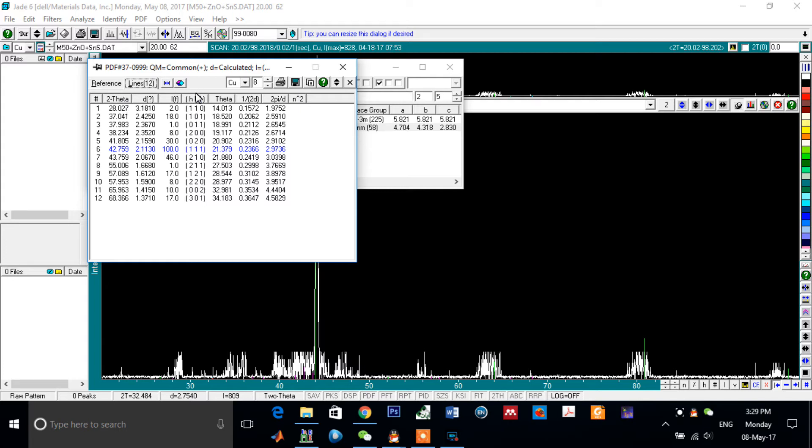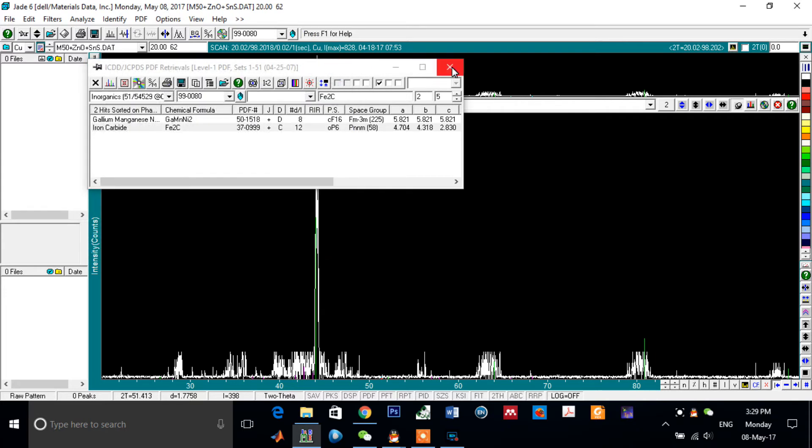HKL of the peaks, of these peaks, according to 2 Theta, as you can see from this window. Now close it.